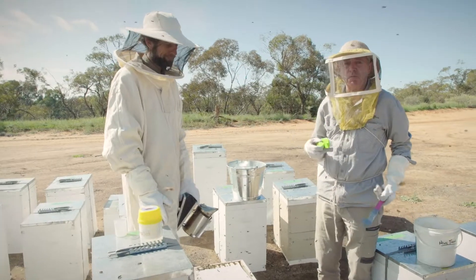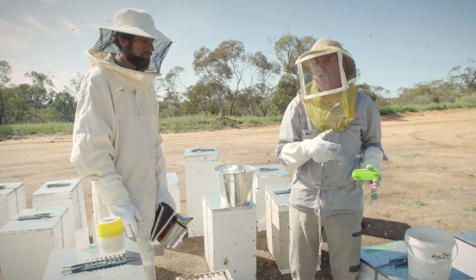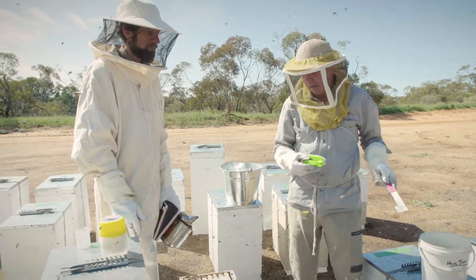Hi, it's Adam Maxwell and Joe Reardon from Agriculture Victoria. We're here to show you how to do an alcohol wash to look for exotic parasites such as varroa in your honeybee colony.